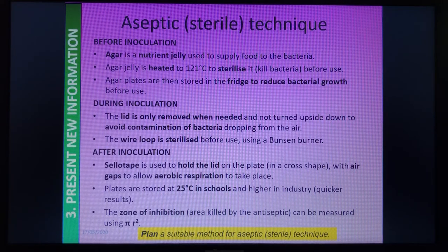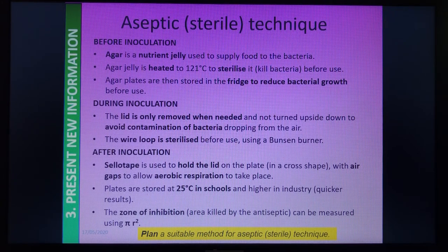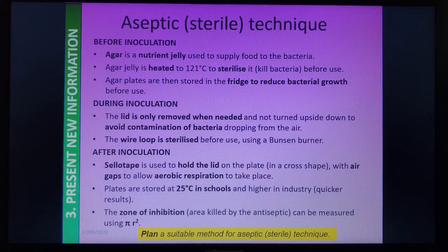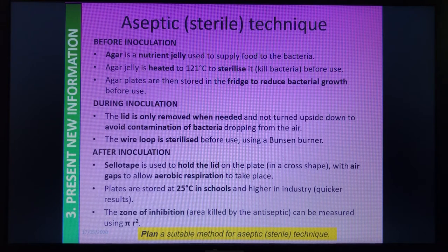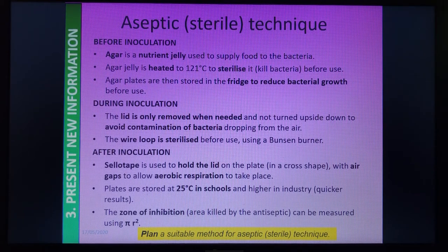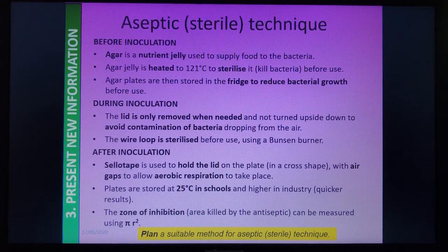After inoculation — once we've put all our bacteria on the plate and added any bleach or antibiotic discs — we need to store it properly. We use sellotape in a cross fashion across the plate to hold the lid in place. We don't tape it all the way around because that would stop airflow and create anaerobic conditions; we want aerobic conditions, so we leave those air gaps. There is a microporous tape available at college or university level that allows oxygen through.